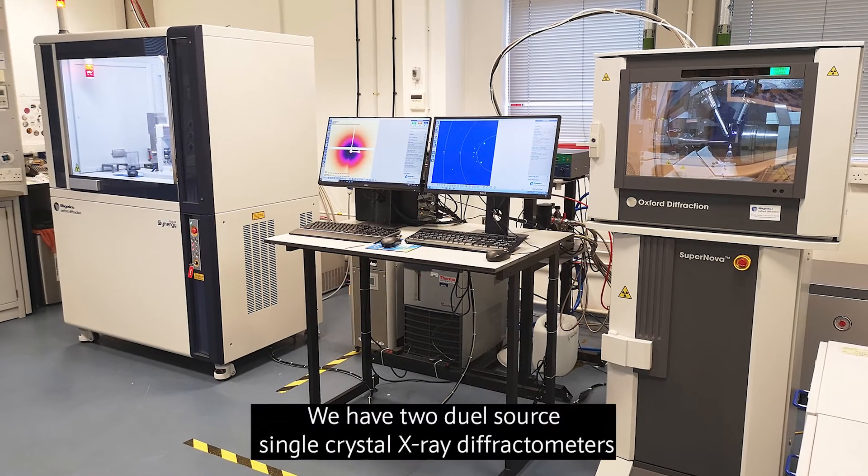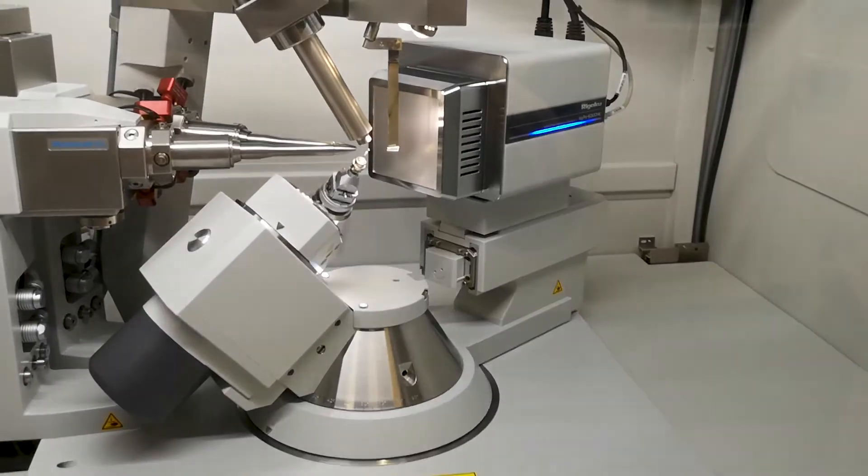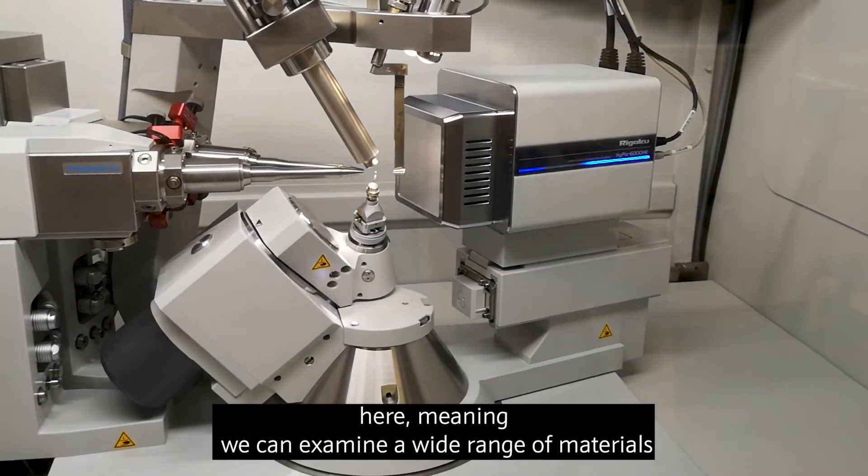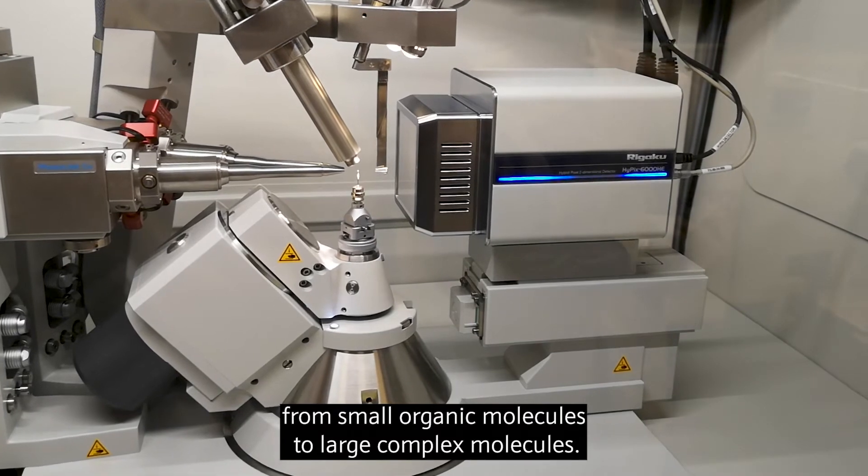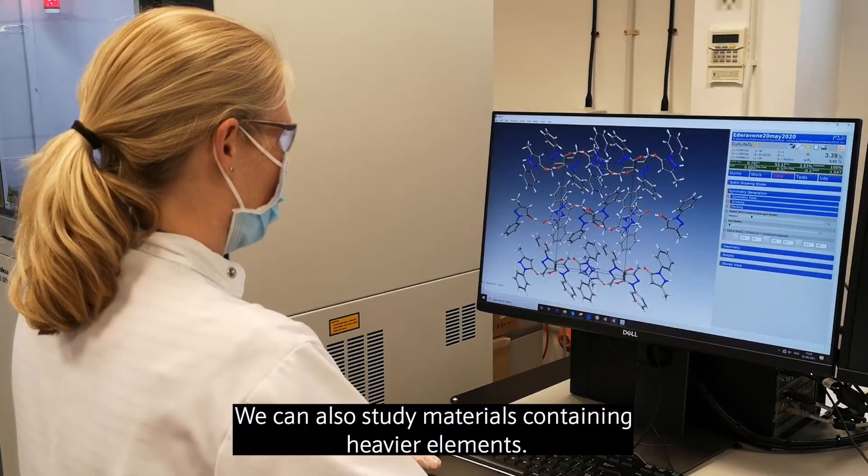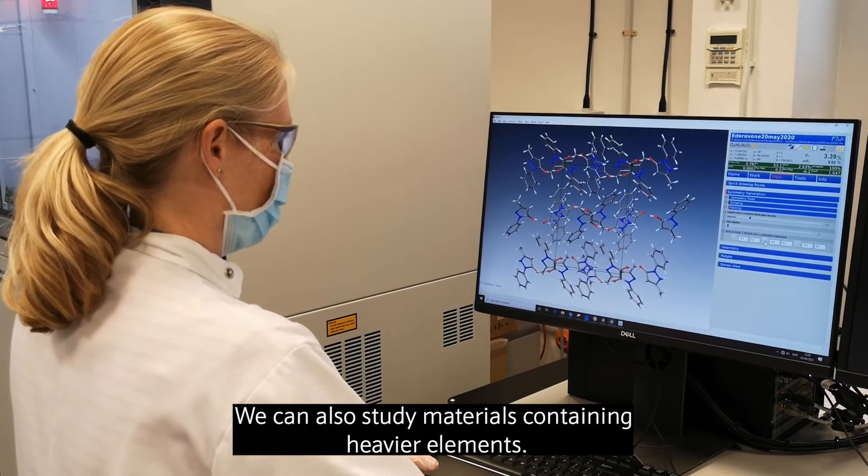We have two dual source single crystal x-ray diffractometers here, meaning we can examine a wide range of materials from small organic molecules to larger complex molecules. We can also study materials containing heavier elements.